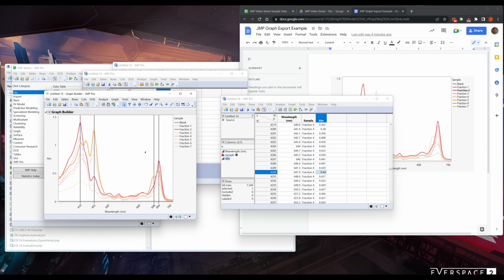And this is the key part. We want you to just be able to come through and label these for us when you submit spectra. If you can tell us what they mean too, that would be great. Here you can see, let's make all these back to 1. We'll tell the story of what's happening here.